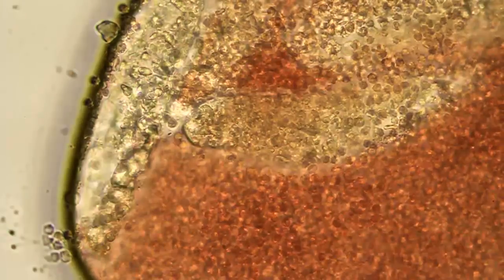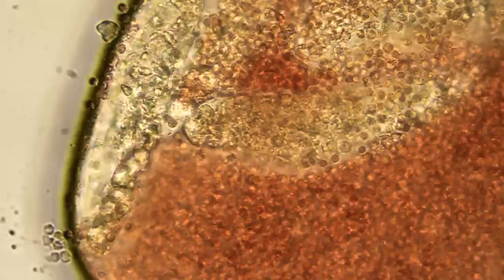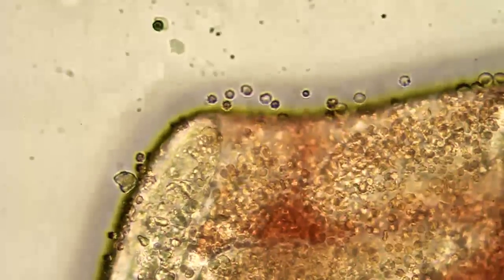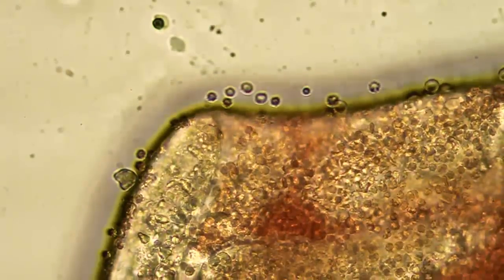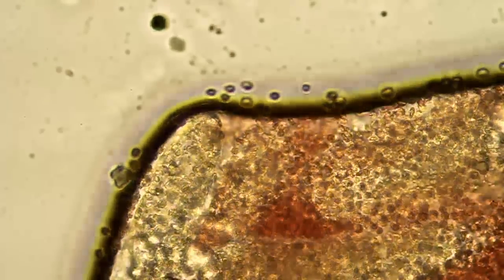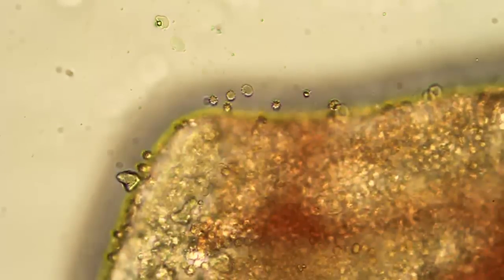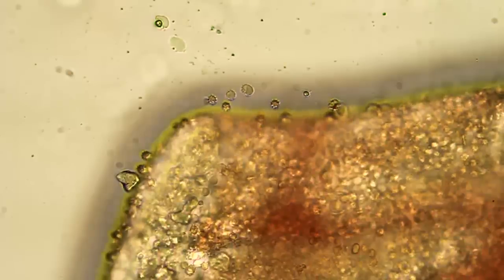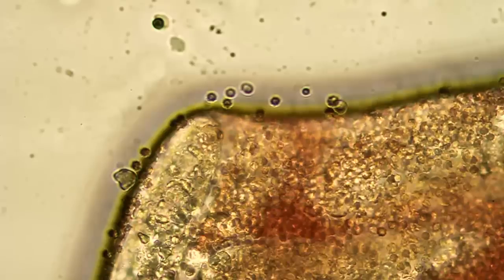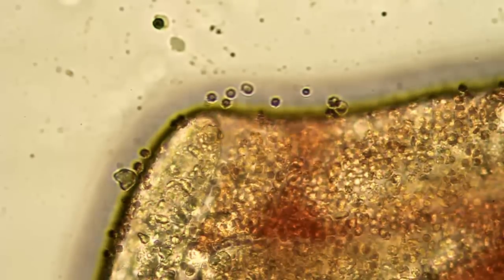Interesting. This is the only liquid I've seen that keeps moving like this. Here you can see the spikes on the individual blood cells. Maybe that's what makes them so twitchy. Makes them itch from the inside out.